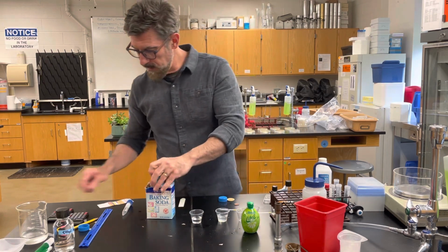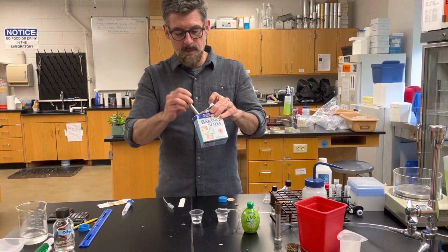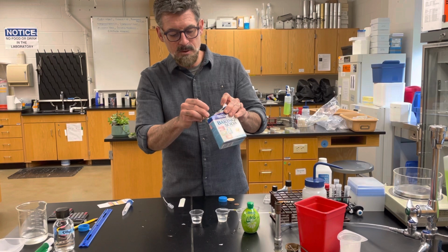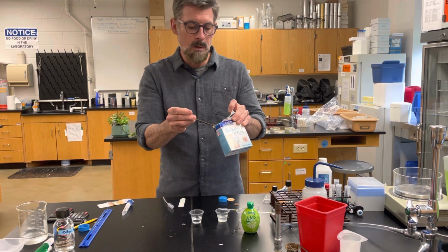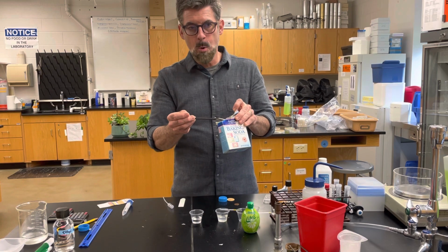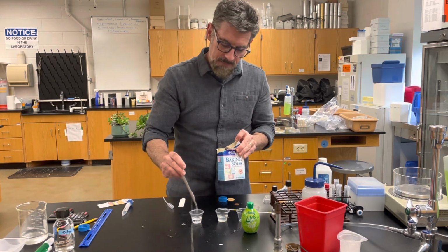And into this one over here, I'm going to put some baking soda. Now, this is a little spatula used in the lab. You could just use a spoon from at home. Don't put a huge amount. I'll say the specific details in the lab. And if you can measure it out, that'd be great. About a 1/4 teaspoon is something that you would have at home to measure with.